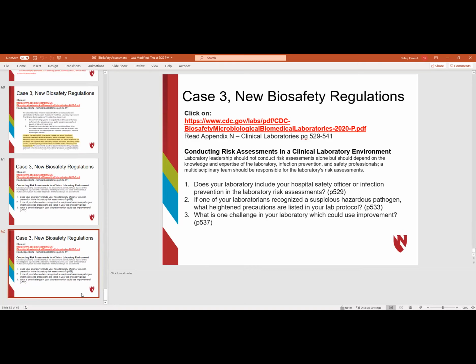So I do encourage you to work on things in your laboratory that might not be a best practice, and you've got to talk about it amongst yourselves and see who best could mitigate the situation. One thought might be you have a physician that likes to walk in with his or her cup of coffee and walks right through the lab. Obviously, don't be hesitant to stop them at the door and say, no food or drink allowed.